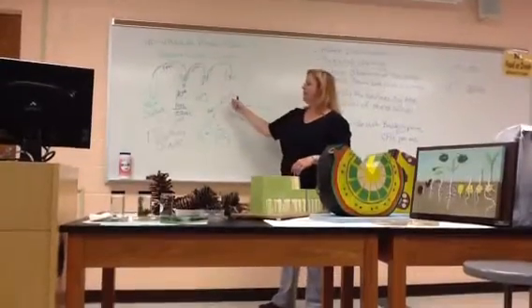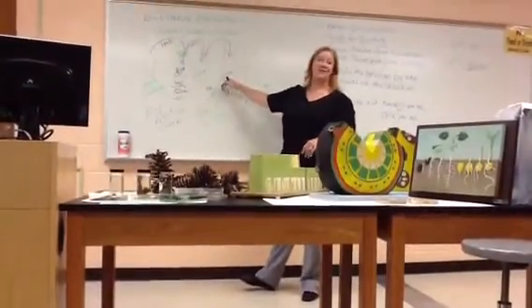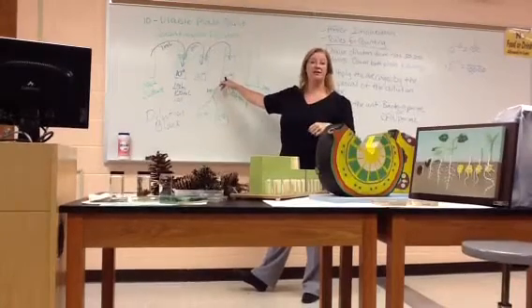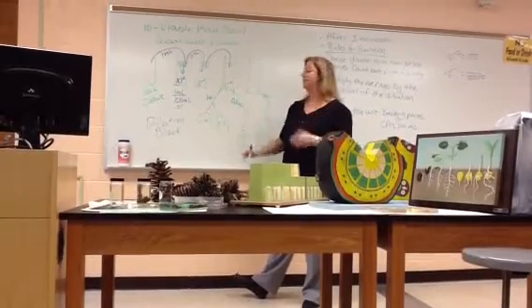Now, we're guessing that by the time we've taken that original ml of stock culture and diluted it all the way out a million times, we should be able to put it on agar and see isolated colonies like you have in front of you for Lab 9. It should be dilute enough now that there's enough space we can see them.